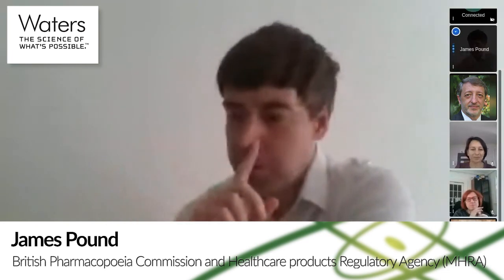Yeah, it's really interesting to see Horacio give an update on where USP are, and I think they've made great progress. If I was to compare and contrast, I think we've taken a very practical case study. So we took a cross-agency group. This involved license assessors from the licensing division of MHRA, GMP inspectors from MHRA, folks from our laboratories, and folks from the pharmacopeia. And we took a product, atorvastatin tablets, and we tried to apply some of these concepts. Think about how it related to methods in the pharmacopeia.